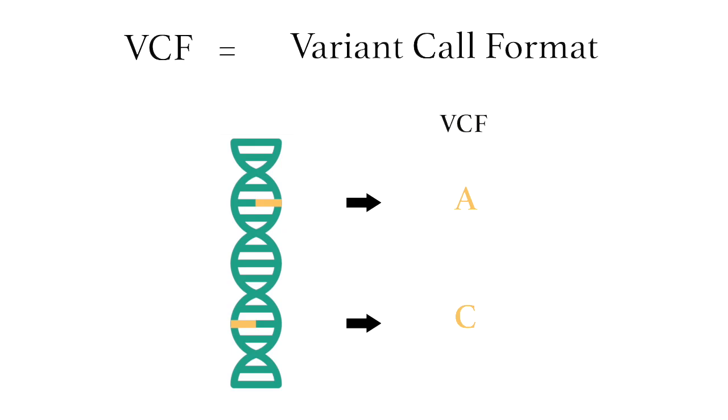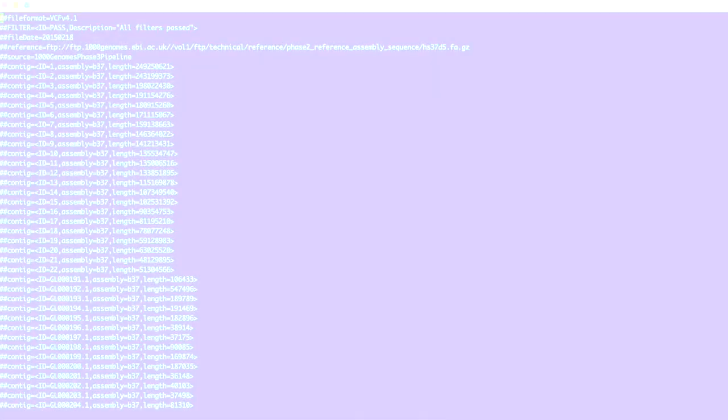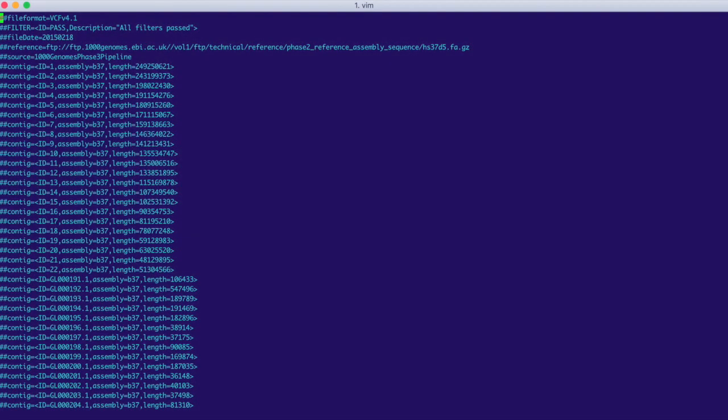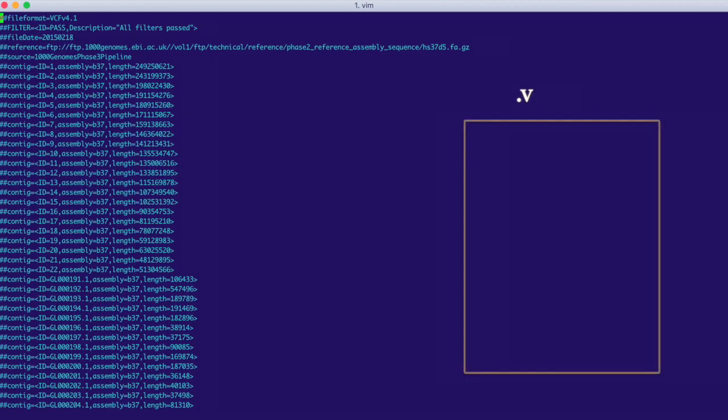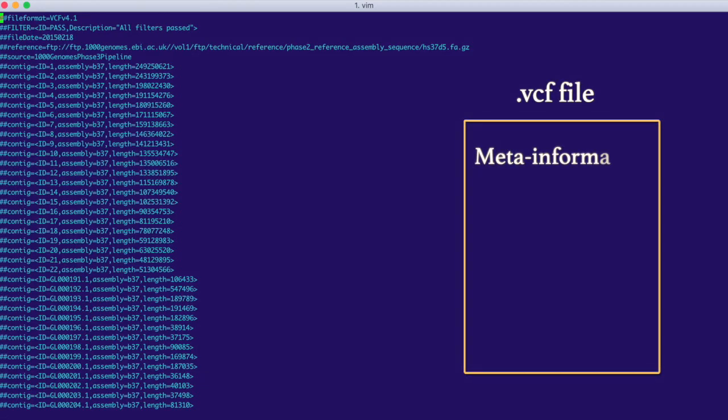To understand better, let's take a look at the VCF file we'll be loading into IGV. So here it is. This is the top of our VCF file. As we scroll down, we're going to see the three parts that make up a VCF: the meta information, the header, and the variants.